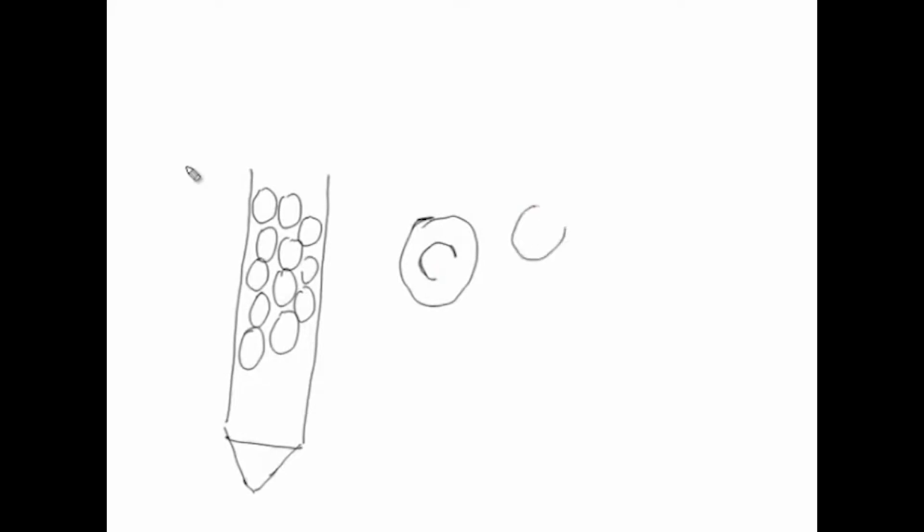If this is the pore size, a molecule which is bigger than the pore size cannot enter here, but a molecule which is smaller than the pore size can enter into the pores. It can access the inner volume of the bead, which is the trapped solvent or trapped mobile phase, but the larger molecule cannot enter. So the larger molecules will only spend time in the interstitial spaces, the space surrounding the stationary support material in which the stationary phase is contained.